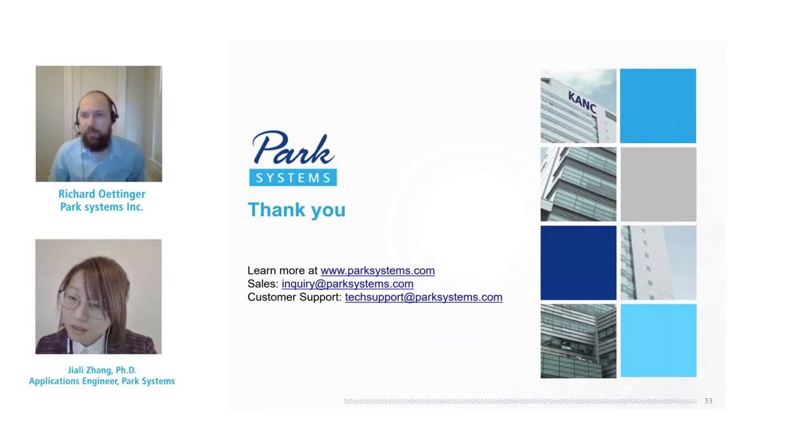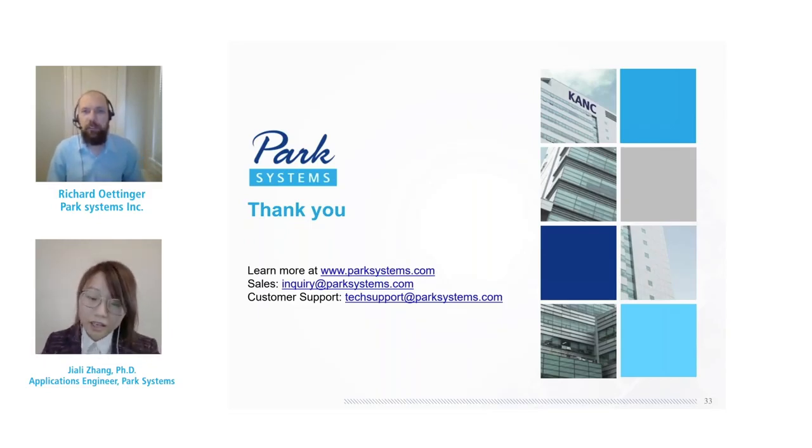Thanks for the question. We did get a couple more that came in, so I will ask those. Can one do conductive AFM with PinPoint, but with IV curves from every point? Yes, that is possible. And we do have a webinar, I remember, on our YouTube channel about conductive PinPoint AFM.